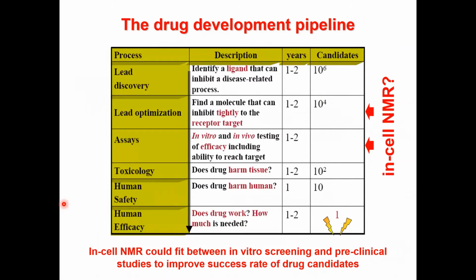Recently, we focused on the possibility of applying this approach to screen small molecules, potential drugs, in living cells.